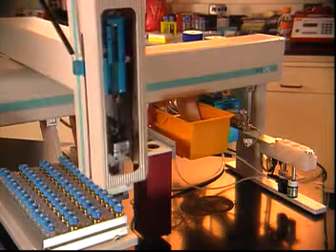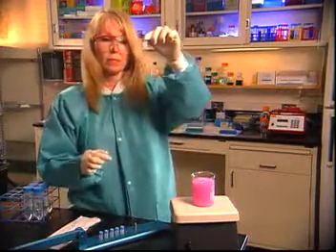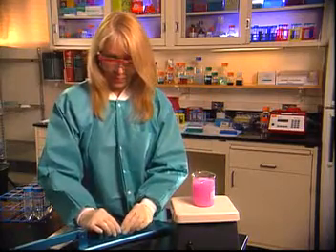Fully compatible with automated systems, Mini-Uniprep streamlines processes, greatly enhances lab productivity, and lowers costs.